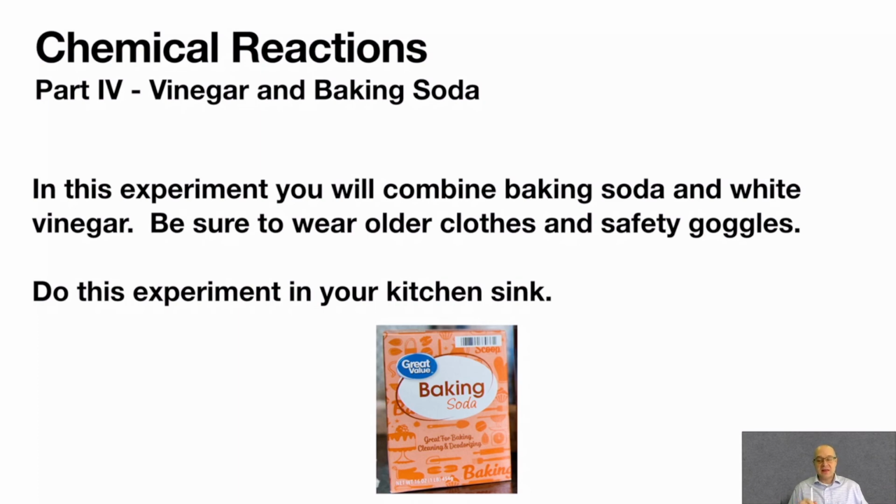If you are sensitive to strong smells like vinegar, you can do this reaction outside. Absolutely no problem. It's very benign to the environment. Just make sure if you're going to do it on your deck or anything like that, anything spills, just wash it off immediately. You should be fine. If it spills in the grass, just flood it with a little bit of water. Make sure it doesn't kill your grass. If you just rinse it, your grass will be fine. But don't let it sit there.